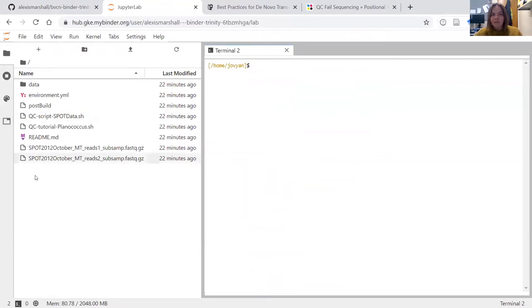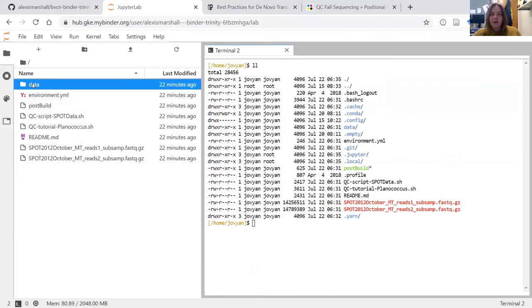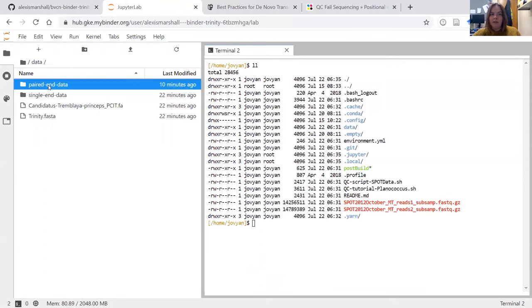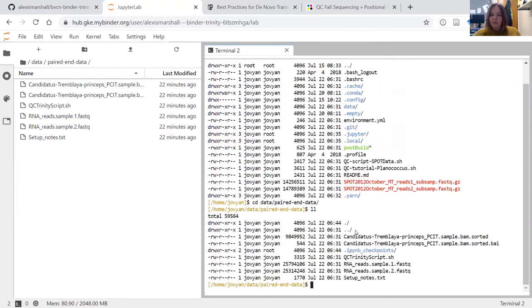This interface reflects the contents of the directories within this tutorial. If you just type 'ls', it'll bring up the same contents seen in the file browser. Today's tutorial is located within 'data' and 'paired end data'. If we just change directory into data, then into paired end, you'll see that the structure of the directory contents matches what's shown here.